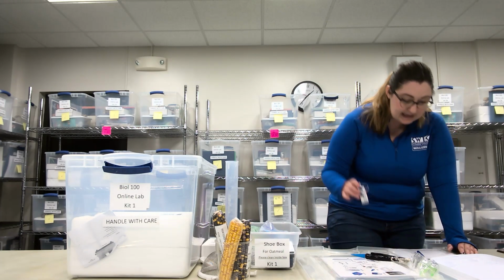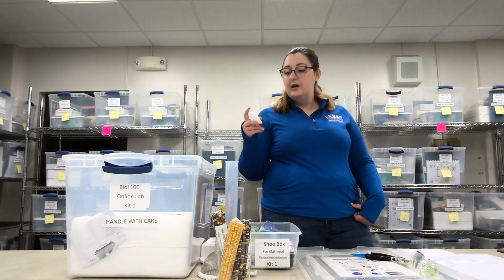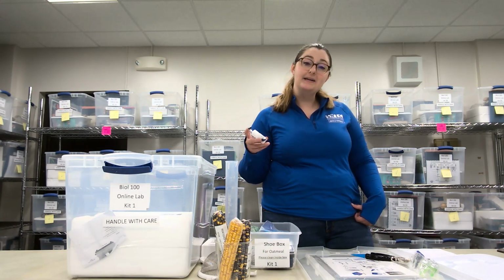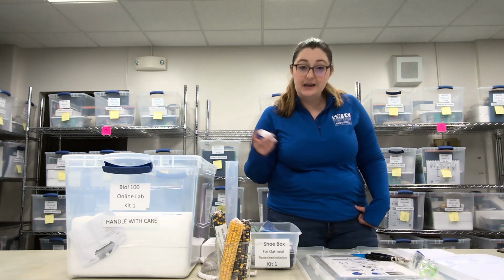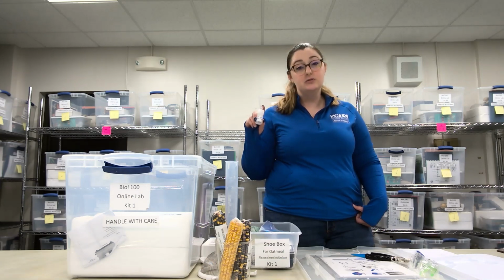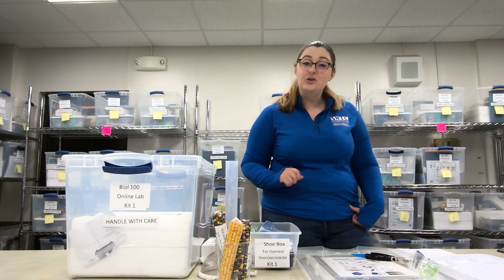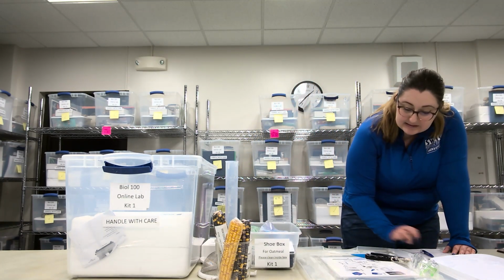Next is a bottle of ethanol. This is the only chemical that we are sending you home with. You need to make sure that you keep it out of the reach of children or pets. Ethanol will not kill them, but they won't feel good. They might throw up if they consume it. So that is why we have put do not drink. So make sure that you have ethanol in your shoebox. Go ahead and mark that off the list.